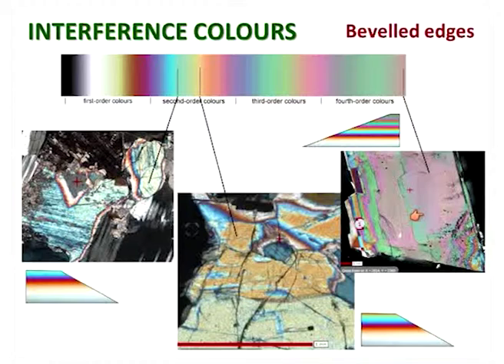What I reckon is that first order colors are very much primary colors: black, grey, white, yellow, and red, very definite red. And then you hit the first sensitive tint, the magenta, which marks the boundary of the order. In the second order, they're still fairly vivid, but I think of them as being a little more pastel and gradational. So you go through a nice sky blue, then almost an aquamarine, then a pastel-y yellow, and then orange, and so on, until you get up to the magenta that leads you into the third order colors.